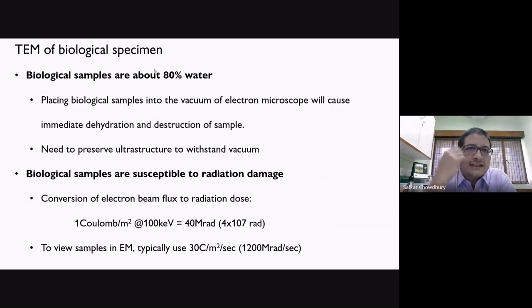In addition to that, at the high voltage and the high energy at which we image these objects, I just showed some mathematical equations where we convert the energy possessed by the electron into a wavelength to basically use it as a wave. Now, at that particular energy, at that much amount of energy, it's almost like having a nuclear bomb, an atomic bomb, just exploding at a small, minuscule level.